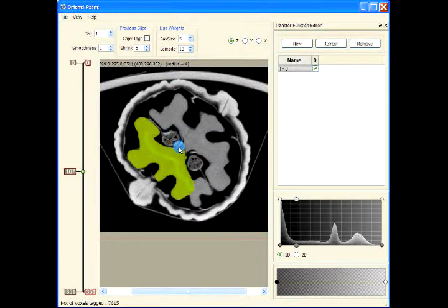Now let me press reset, R, and let me change lambda. See, lambda can go from 1 and it can go up to as high as 50. So lambda 1, and now let us see the effect. Press T and then you can see that it has tagged much more region, a lot more region. Press R again, reset. Let us change it to say 20 and let us see the effect. And you see that this is much tighter compared to the last one.